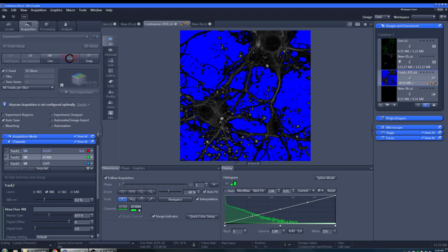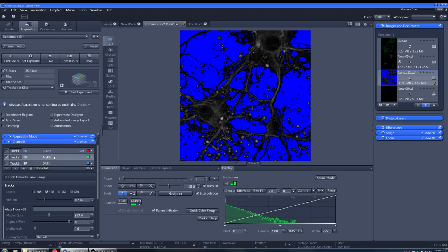And in Airyscan mode, you see the normal detection and also the Airyscan detection. So you have two tabs and also two curves in the histogram. You can see it here. So at this point, the green is fine. And I deselect and do them one by one, otherwise it can be a bit confusing.